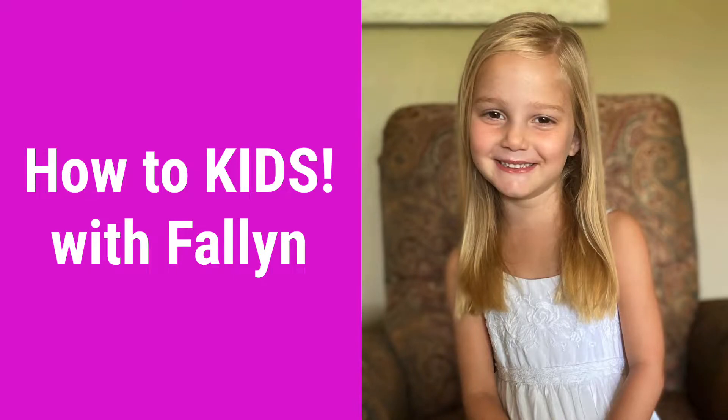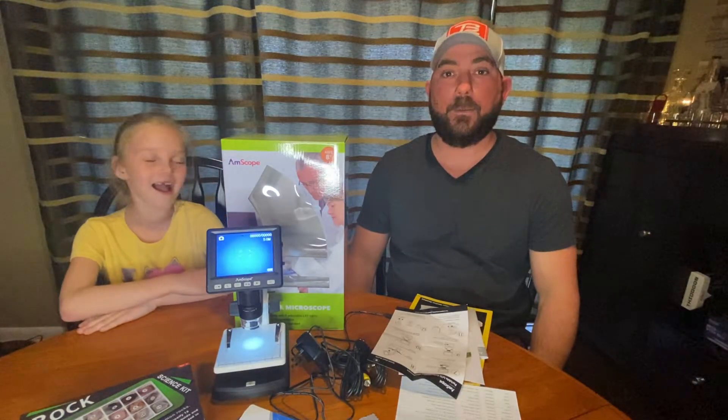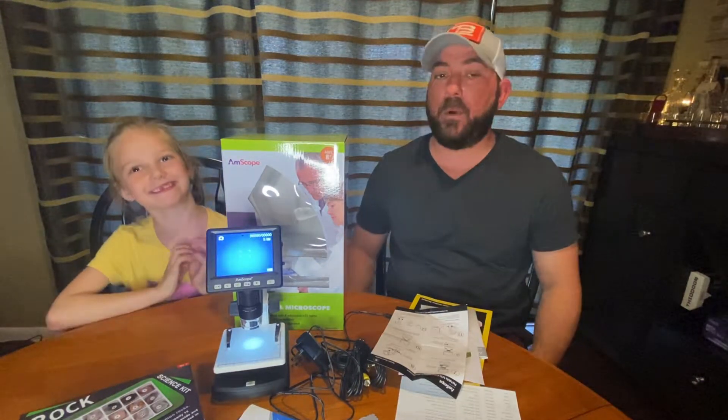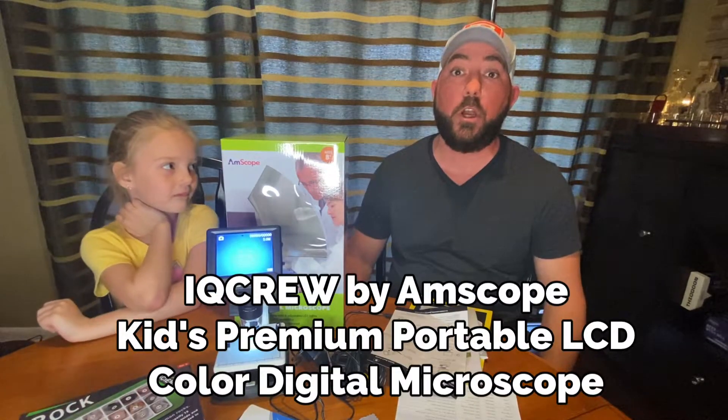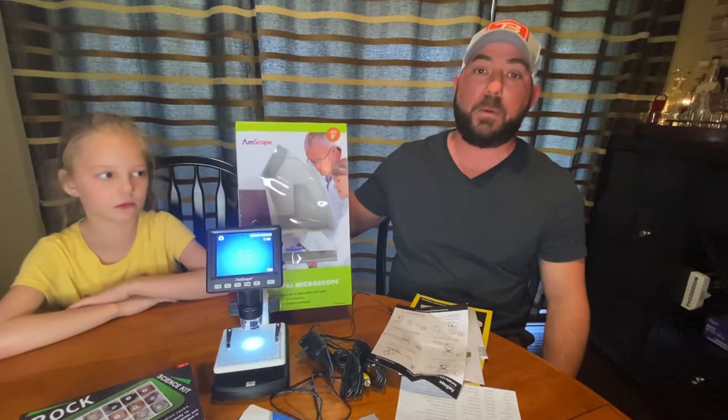Welcome back to How To Kids with Fallon — that's me, that's you. Today we're going to do a quick product review on Fallon's new microscope, the AM scope. This thing is pretty cool.